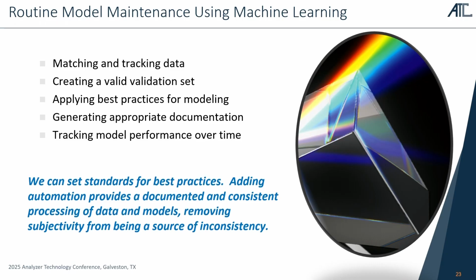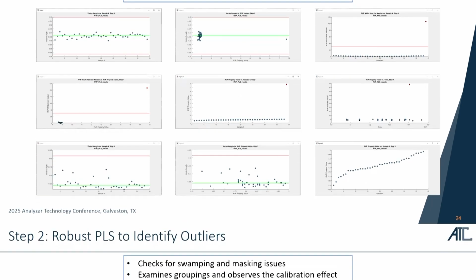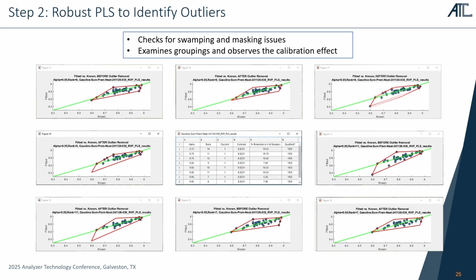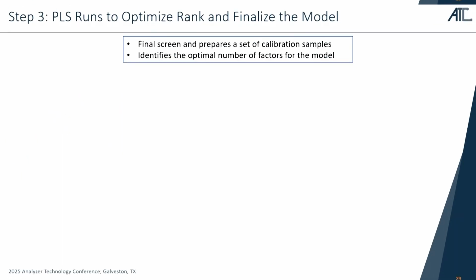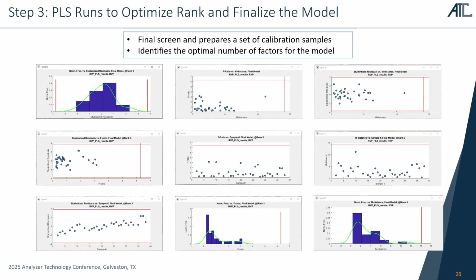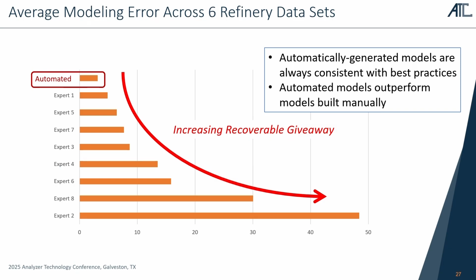But I thought what I'd do is I'd just show you in a blast, going through and taking a Raman model and just optimizing it. Here are all the steps that are done in an automated system. So you're doing some evaluation in this, and it does those evaluations in order to come up with an answer. And what we found is this approach actually beats humans every time.